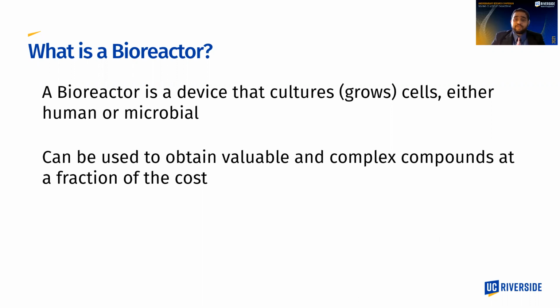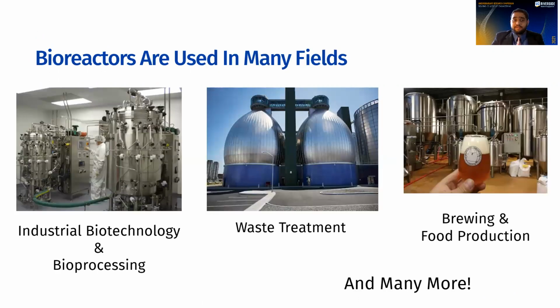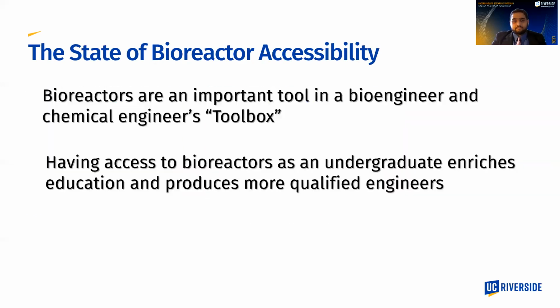And this type of workflow is why bioreactors are used in a variety of fields. This includes industrial biotechnology and bioprocessing, which are responsible for the COVID vaccines, as well as waste treatment, where bioreactors are used to break down organic waste into smaller compounds, and brewing and food production, as well as many other fields. So with all these uses, it's important to state that bioreactors are an incredibly important tool for bioengineers' and chemical engineers' toolbox.